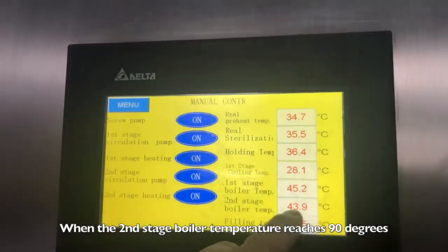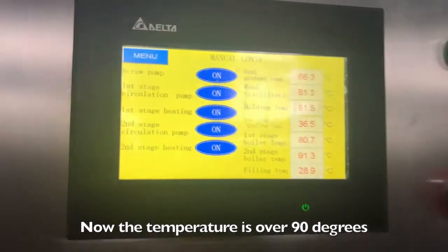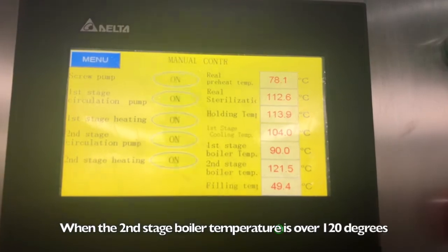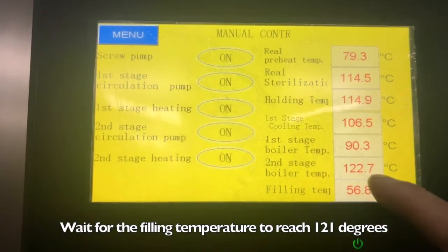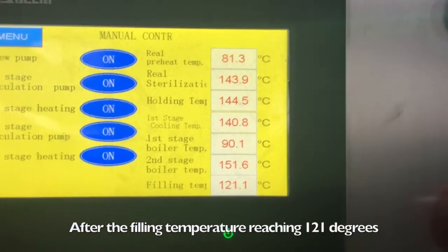When the second stage boiler temperature reaches 90 degrees, close the overflow valve of the second stage boiler. Now the temperature is over 90 degrees. Continue to pressurize the back pressure valve on the right and wait for the filling temperature to reach 121 degrees. After reaching 121 degrees, keep it for 2 minutes.